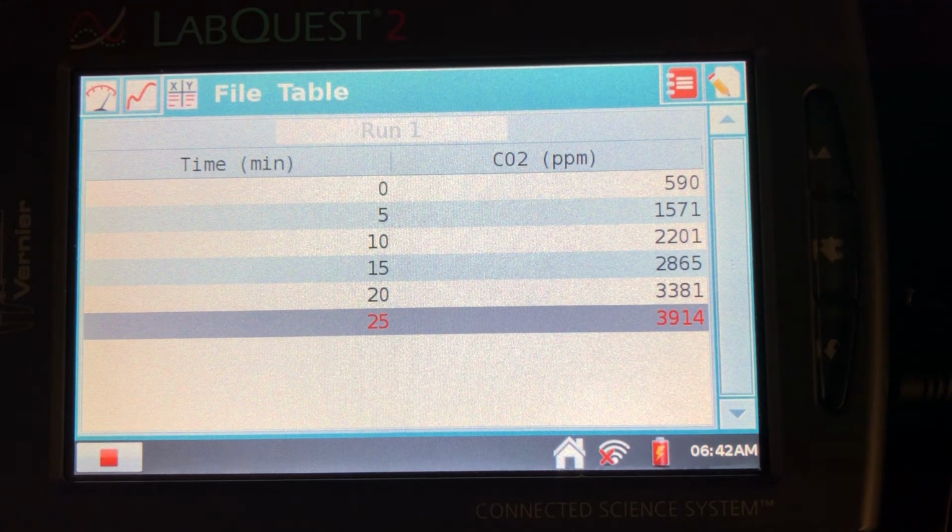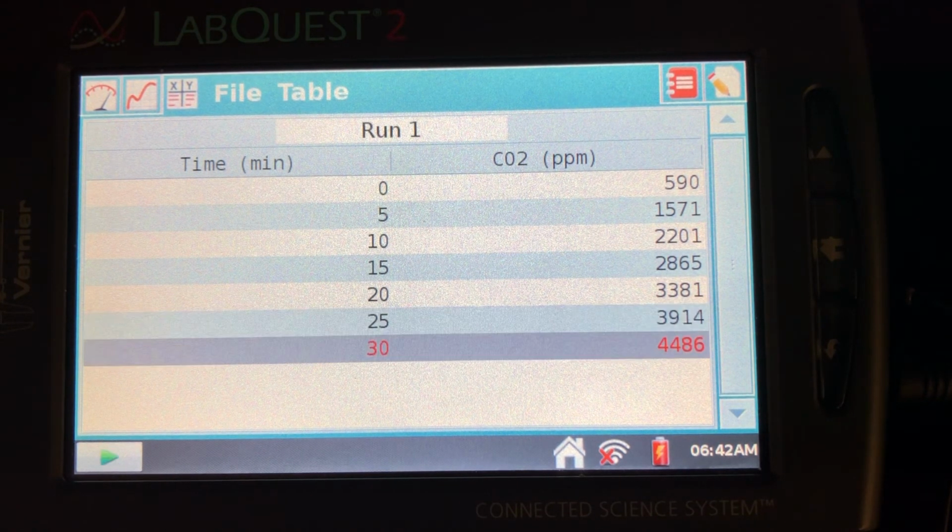And then we have data table 2, where we're going to put our raw data in, which is the numbers that are here. And we're going to have to transfer that data into CO2 produced, cumulative CO2 over time, into data table 3. And then once we have the data table 3 completed, where we know how much CO2 is being produced over the 30-minute period, then we want to divide each increment by the mass of the organism so we can get the cumulative CO2 produced per gram.